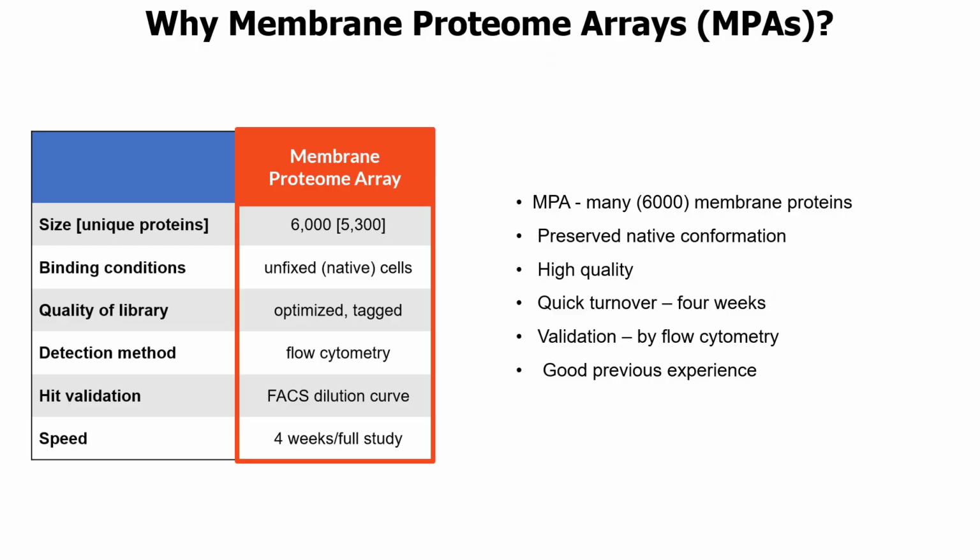As we all know, specificity is extremely important for safety. Actually, FDA asks for safety and then efficacy. And there are different ways, of course, to evaluate the specificity of our antibodies, but why membrane protein arrays? Why did we select that platform?